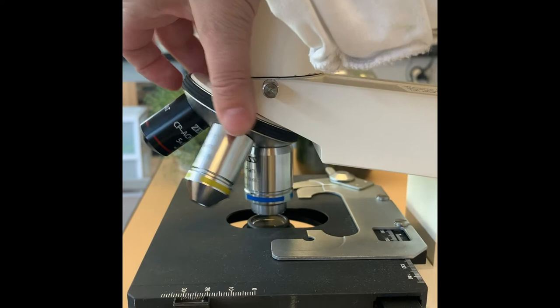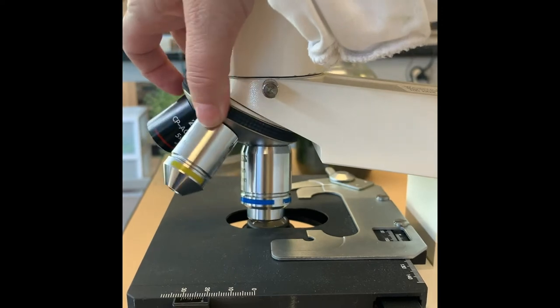Finally repeat again with the 400x or high power objective. Notice here you can't see any of the lines at all, so we know that the value is less than a millimeter, but we don't really have any landmarks to tell us where it is in that range.